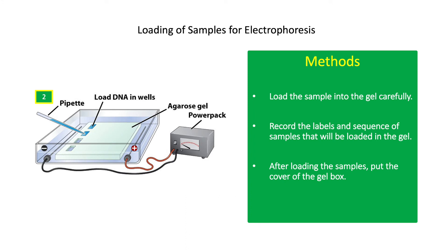Load 5 microliters of the sample into the gel carefully. The gel is transparent, so careful attention should be taken when loading the sample into each well. Make sure to load the DNA marker on the first well, followed by the negative control. All samples loaded should be labeled properly and loaded with respect to their positions or arrangement. Record the labels and sequence of samples loaded in the gel, as these will be used as a reference when the gels are viewed after electrophoresis.